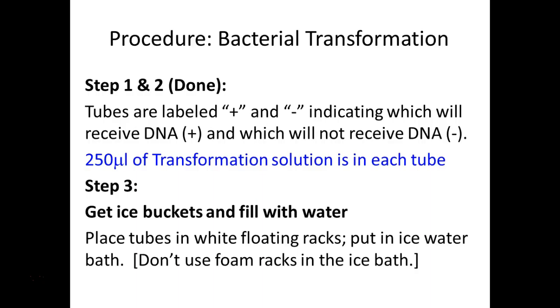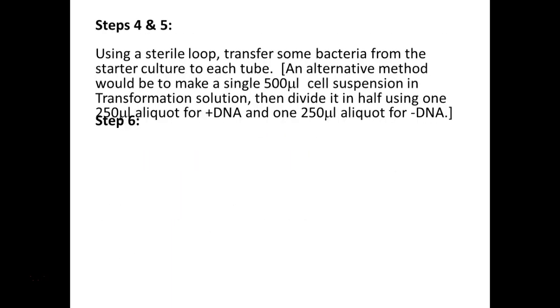Those foam racks that are in your cases are just for holding on to our tubes, and another tube that I'm going to give you later. They unfortunately stay wet if we use them for the other stuff. So we have our plastic racks for that.